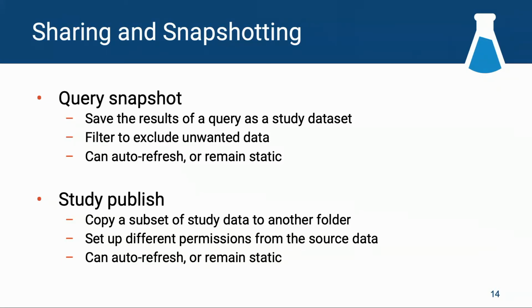Yes, those who have been at previous LabKey conferences or looked at some of the Zika portal work, where Dave O'Connor from the University of Wisconsin-Madison, basically they have what they call their master study, where they have all of their Zika data for all their animals on study in one centralized place.